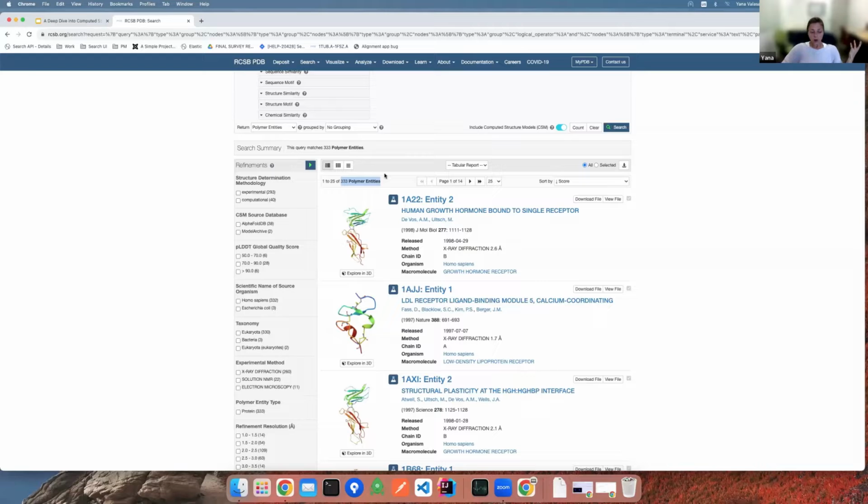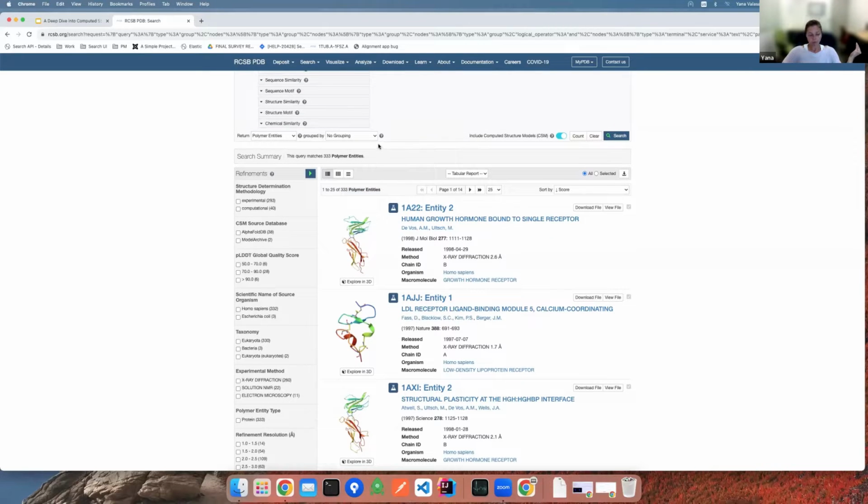So that is where an ability to render your results in a non-redundant manner comes in useful. You can activate it by using a group by setting that is located in the Advanced Search tool. And here I'm interested to see all the structures relevant for a given UniProt reference sequence.